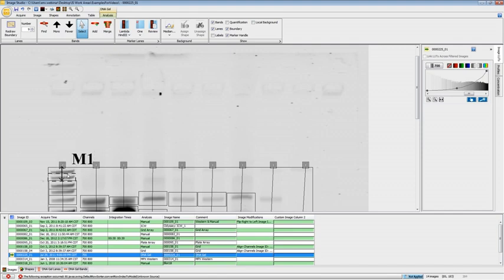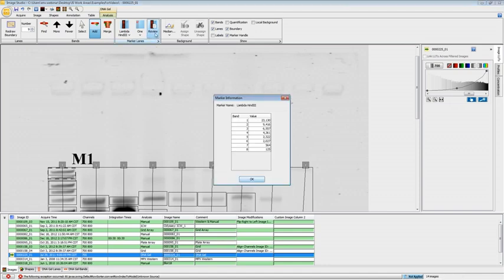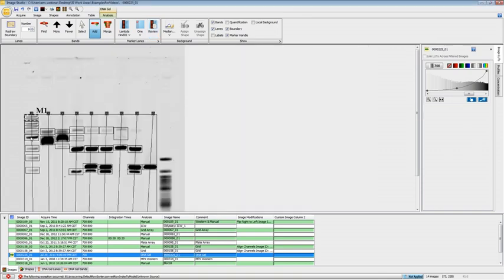It actually did not find the correct number of bands. Now, this illustrates the point that it does need to be accurate as far as the highest molecular weights on here, because under the review, previously I did not have this set correctly, so the molecular weights that are defined on here were not mapped to the appropriate locations.